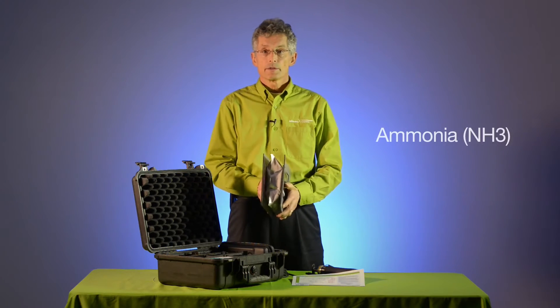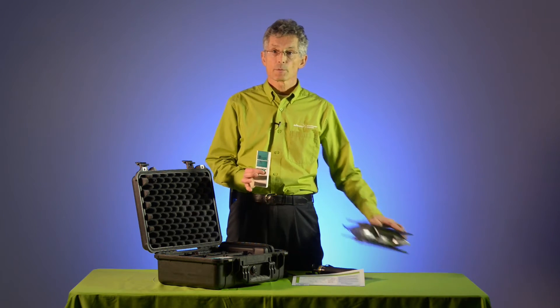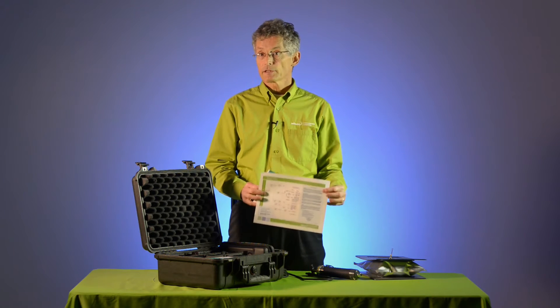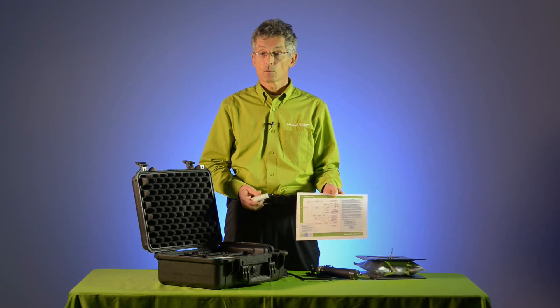Let's take a look at how this works. We'll present an ammonia scenario. In this bag we have some ammonia gas. We'll use the tubes to sample from the bag, following the decision chart, to see if we can identify both the gas and estimate its concentration. According to the decision chart, we will need to start with a Polytech number 107 tube.